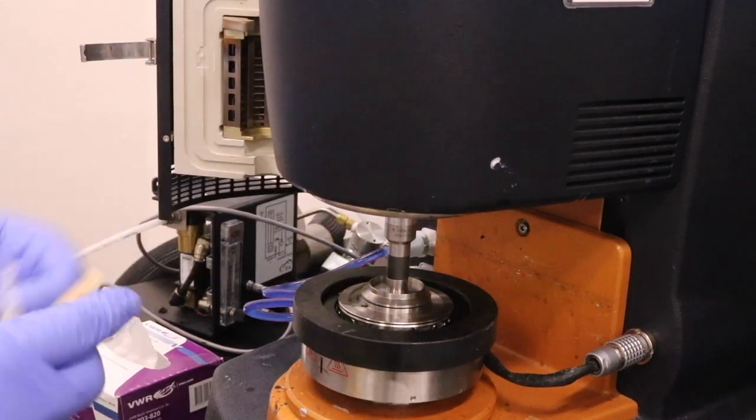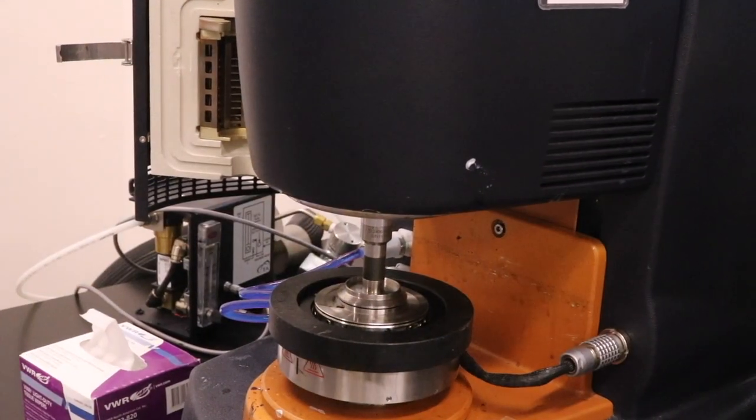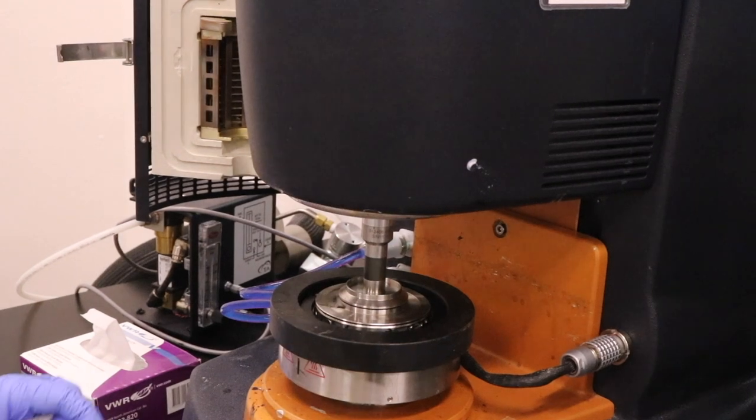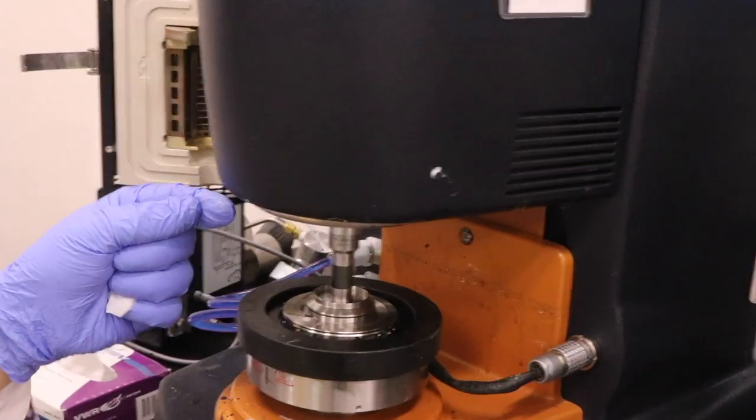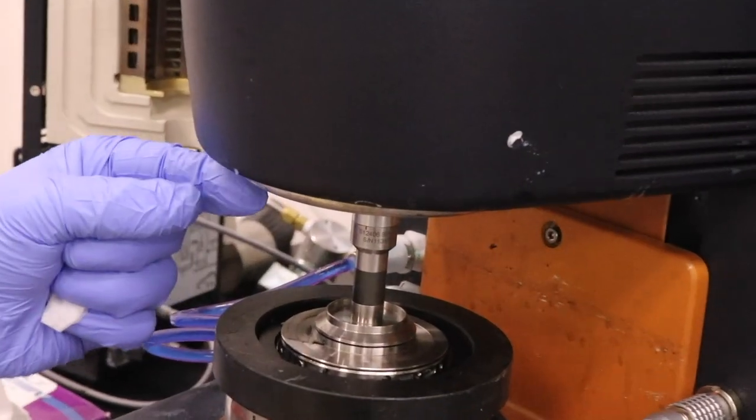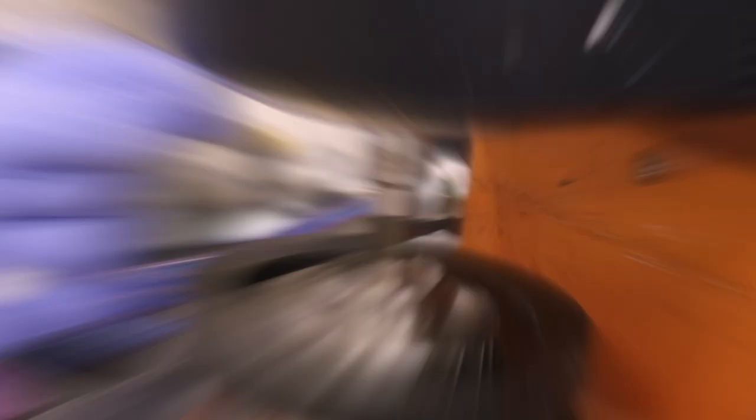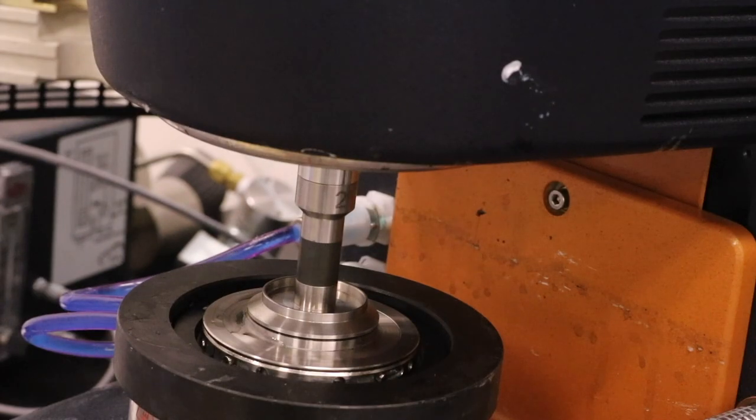So now we can start the test. And as you can see here, the top plate will rotate from a small shear rate from about 0.1 to 1,000.